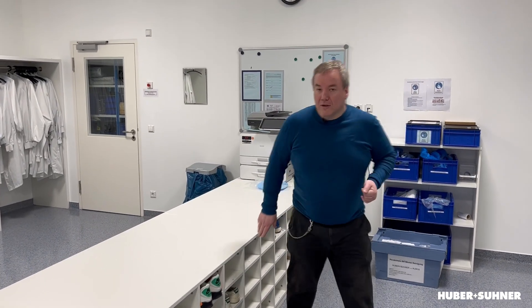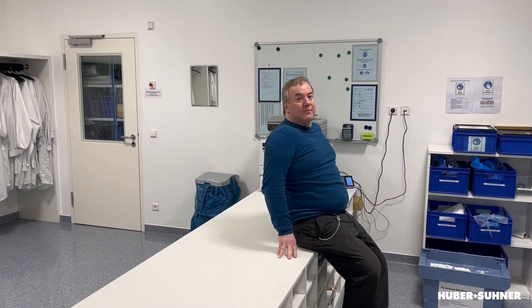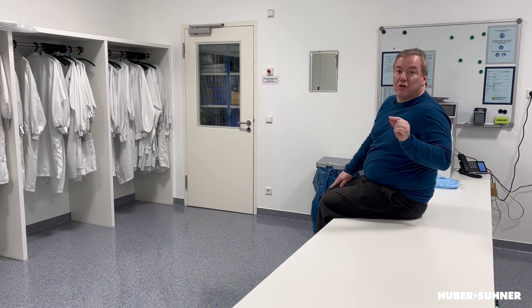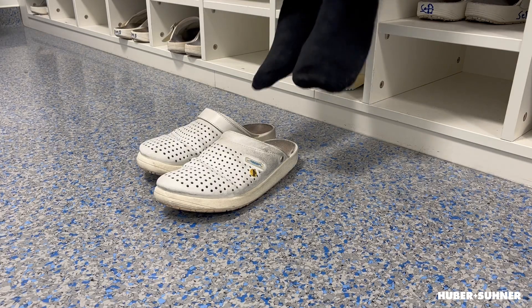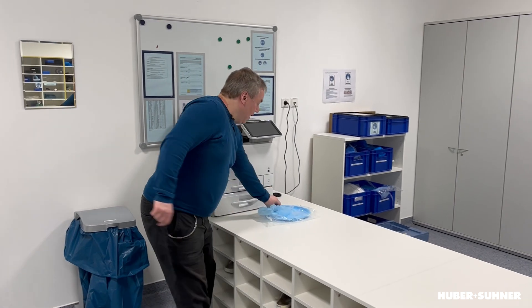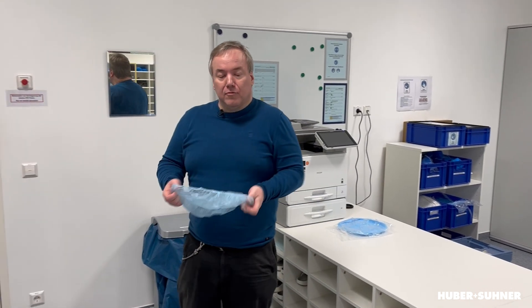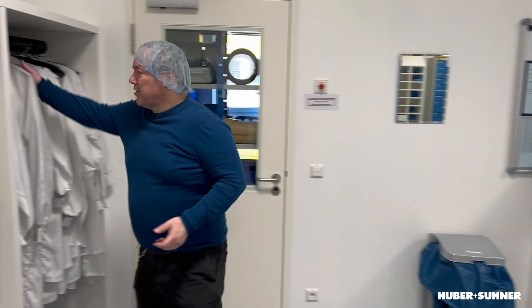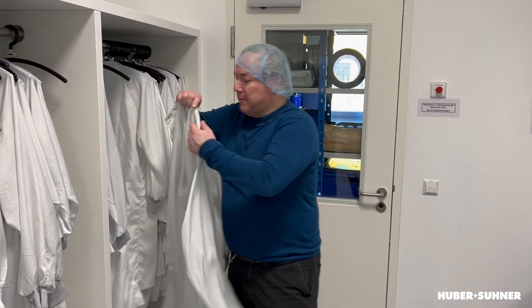So first of all, take off your shoes and swing over the bench. On this side, pay attention not to touch the ground — go directly to your shoes. Next is the hairnet. And the last step before entering the clean room is to take the clean room coat, which is made of a special material which is extremely particle-free.